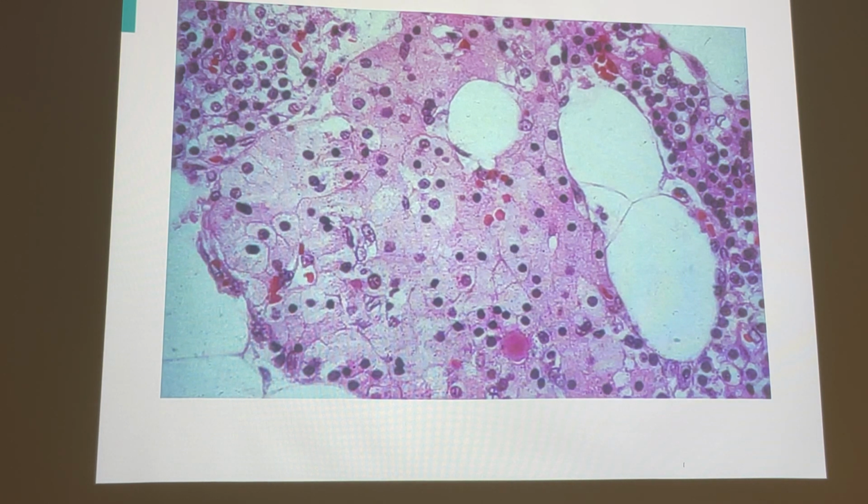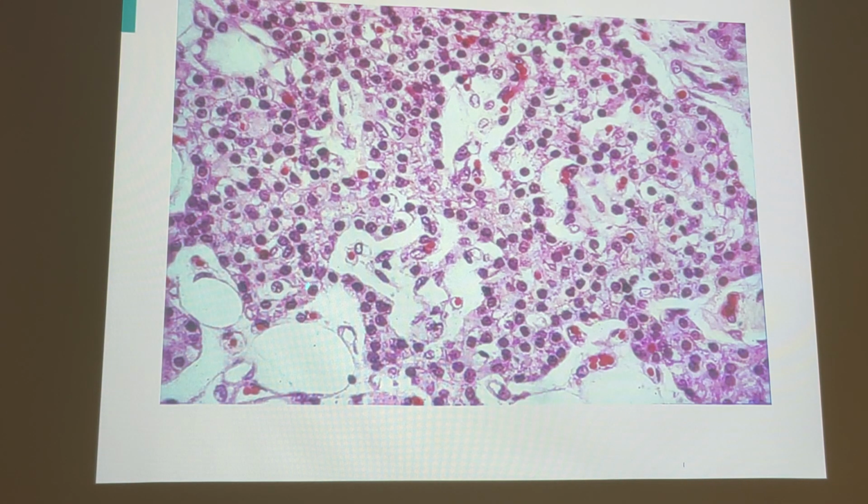Do you see all these big, huge cells with big, clear, massive cytoplasms compared to these cells over here? Oh, okay. These are oxyphils. All these smaller cells are the chief cells. Notice here we see them as well. The smaller cells are the chief cells, and here we see fewer of those oxyphils, but they're larger, they're lighter in color. And that clear light color is kind of where they get their name oxyphil, but also gives them a distinct characteristic, which is also what makes our chart so hilarious.